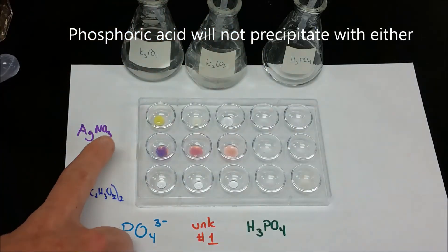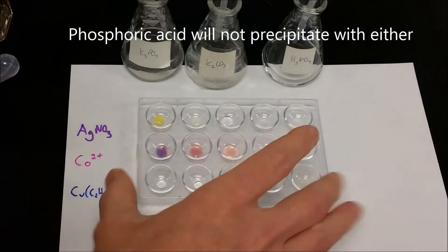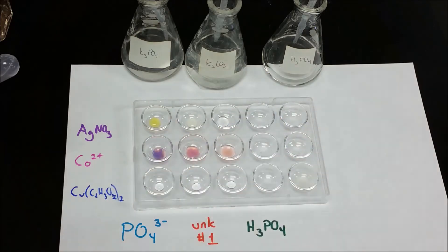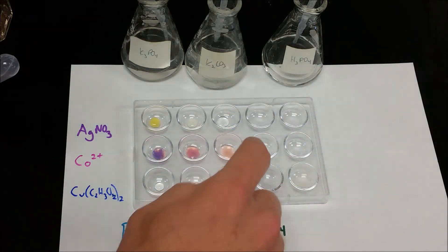So we see that the precipitate here is different than the unknown, but the phosphoric acid didn't form a precipitate for the silver nitrate nor for the cobalt compound.